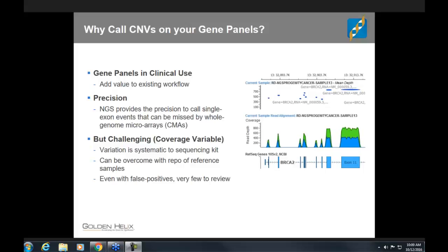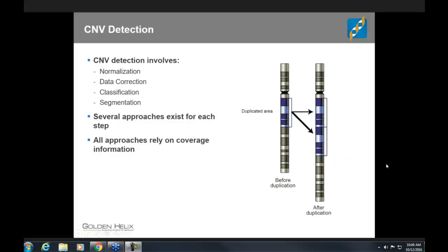And so with that, let's go ahead and pass this over to Nathan, who will give you the background on this method and demonstrate it in VarSeq.